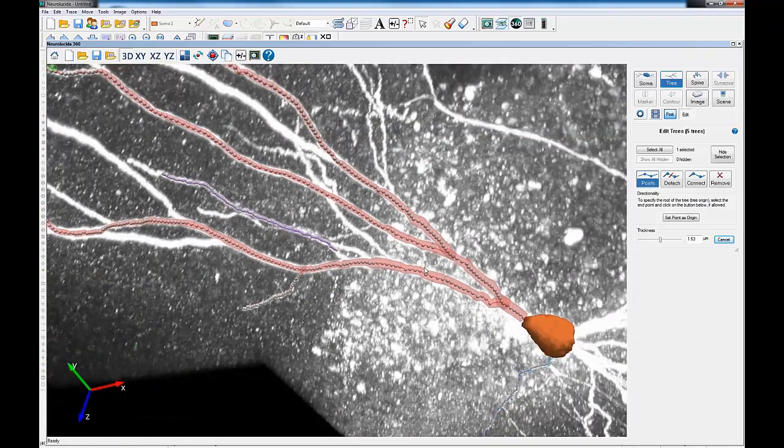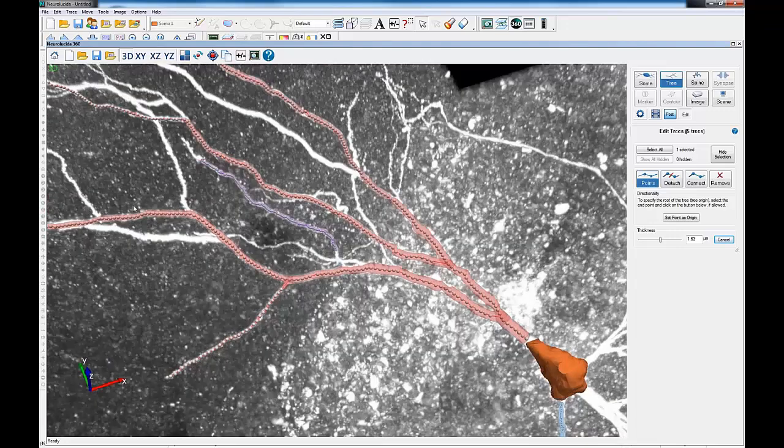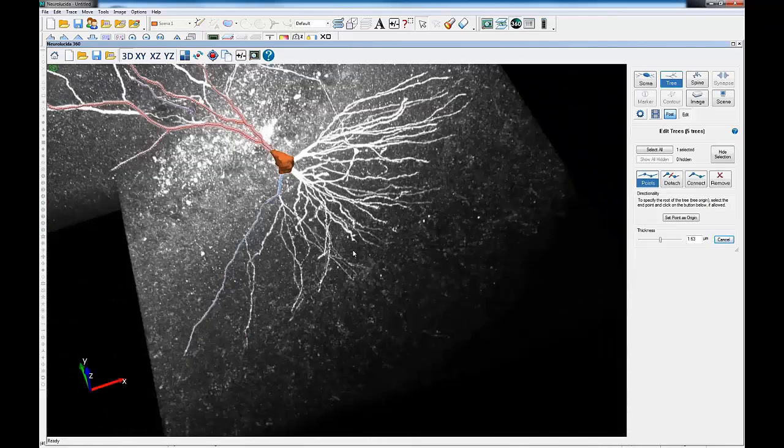Susan, how different is this interactive version versus the completely automated one? They use the same algorithms. It's just when you are using the interactive mode, you are providing a bit of guidance for which segments belong to which branches and how these complicated connection points should be connected.